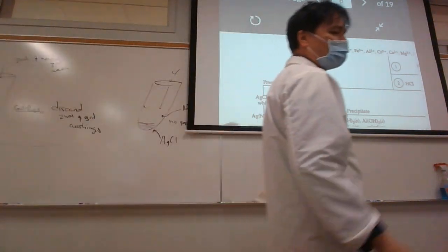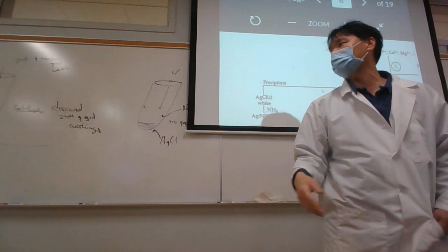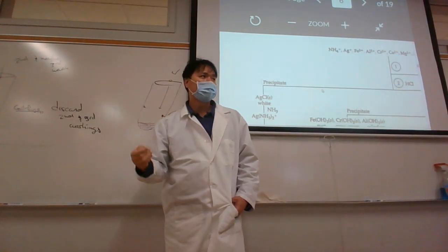So this is what I mean by you can't just follow the procedure. The procedure is one size fits all. And if everybody didn't have silver, then it'd be easy. Don't add any HCl, right?